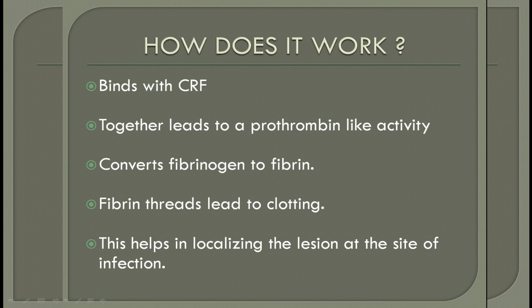It binds with CRF, the coagulase reacting factor I've already mentioned. After binding, together they lead to a prothrombin-like activity. This complex has a prothrombin-like activity.